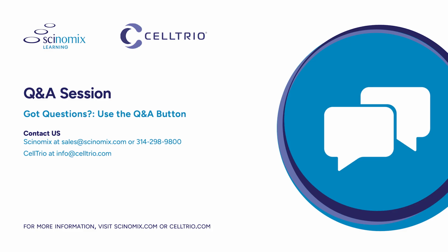Matthew Murphy asked, does the MP2 scanner only do barcode verification, or can it communicate barcode information to other steps in the workflow? Yeah, so it can communicate it to other steps in the workflow, to my knowledge. Is that correct? Yeah, and it's really through that CSV file or the output file for scanning. You can have that code. Again, you've already inputted that file, so we're doing that verification. But that code, as long as it's scanned, verified, and true, can be utilized in downstream sequences.